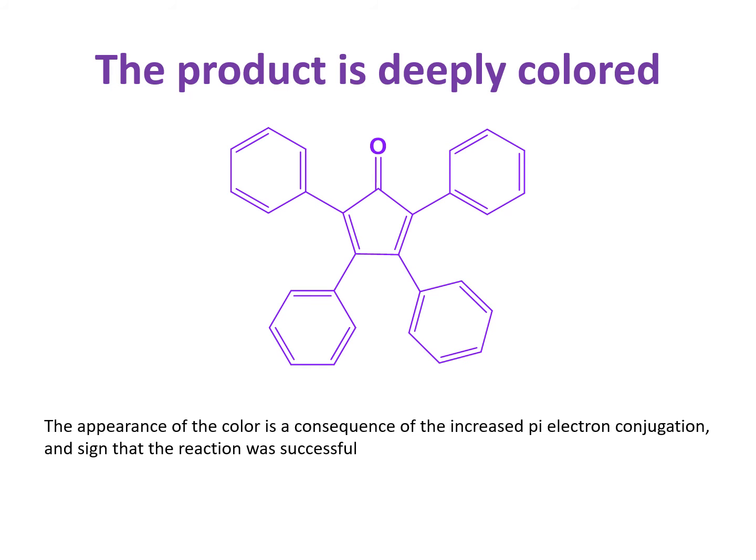The confirmation result for the product is a purple color solution, and that is an indication of the formation of this highly aromatic compound, stabilized by resonance.